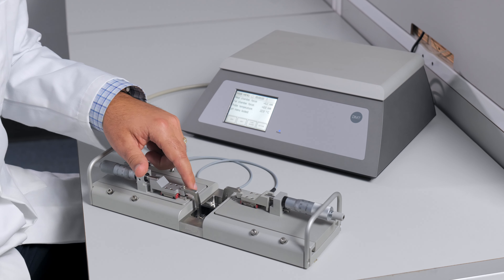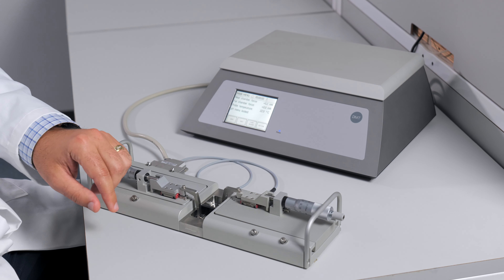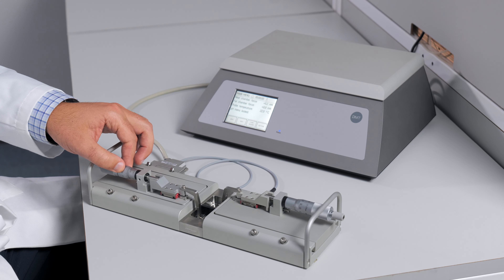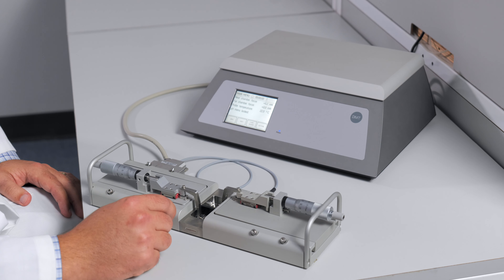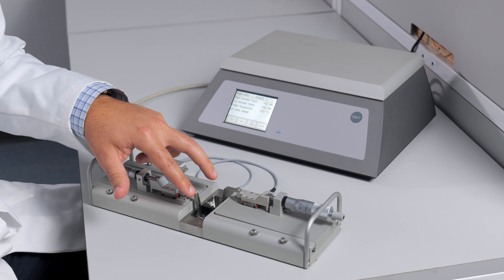Each side will have a positioner side and a force transducer side. The positioner side is connected to a micrometer that allows you to smoothly move the mount back and forth, while the force transducer side is stationary and collects the forces generated from your tissue. The two chambers are separated from each other with a chamber divider, although this can be removed to allow the two sections into one bath.